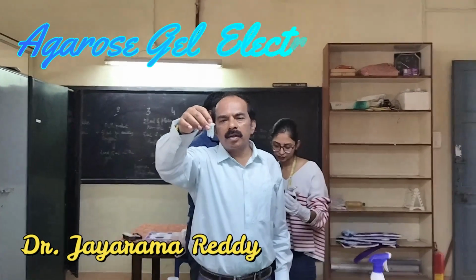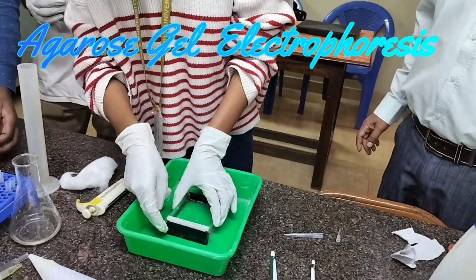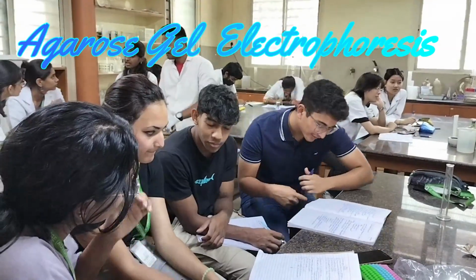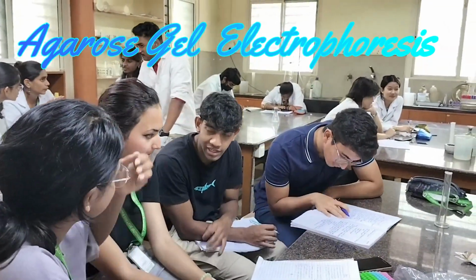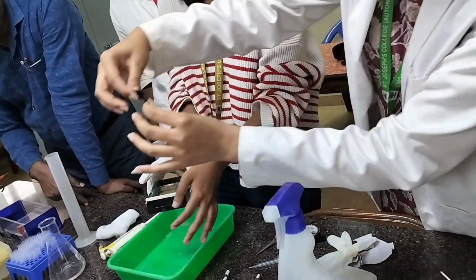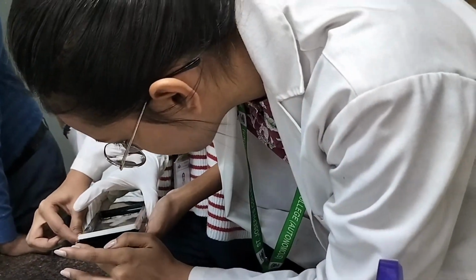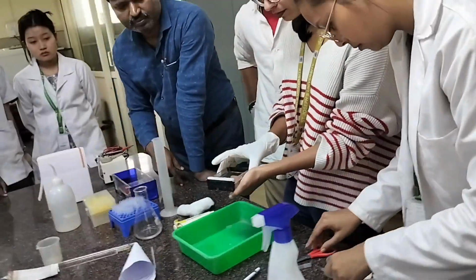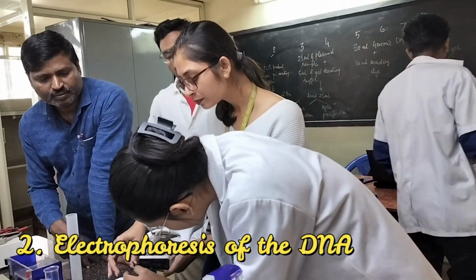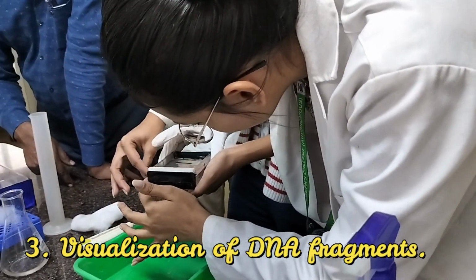Hi, agarose gel electrophoresis is a procedure used to separate DNA fragments based on their molecular weight, that is in turn because of their sizes. It is an intrinsic part of almost all experiments in molecular biology and biotechnology. There are three steps involved in this practical. Number one is preparation of agarose gel. Number two is electrophoresis of the DNA. Number three is visualization of DNA fragments.